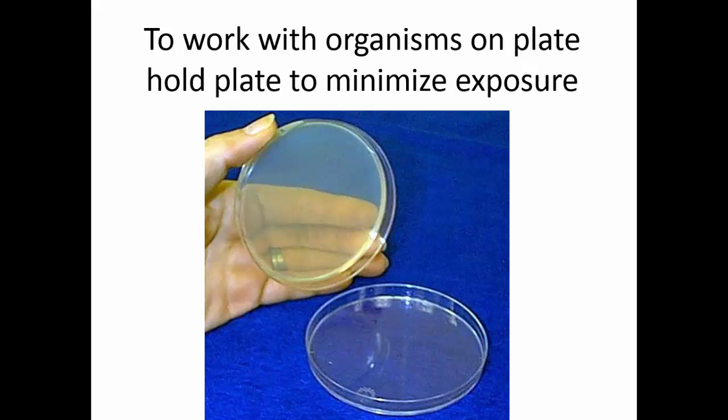When you work with your microorganisms on the plate, you want to minimize any kind of handling of the plate. If you have the agar side up, it's very easy to simply lift the bottom out of the lid, leave the lid sitting on the table, it was sitting on the table anyway, and then you can work with the organisms on the plate. If you were to do it the other way, have the lid up, you would have to take the lid off and set it on the table, and then you would have to figure out how to pick up that agar piece without sticking your fingers in it. So this is just an easier way to handle the plates.